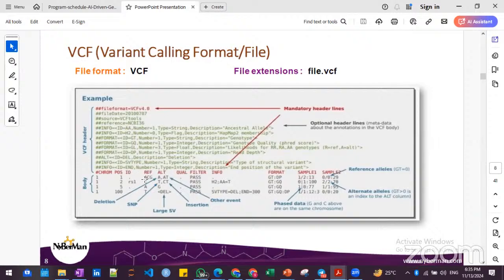So if the reference nucleotide is ACG, then the alternate has changed, maybe due to an environmental issue or hereditary causes, and the allele is changed to only A, or sometimes it is captured by the tool as AT, but it is not ACG actually, so it is changed.